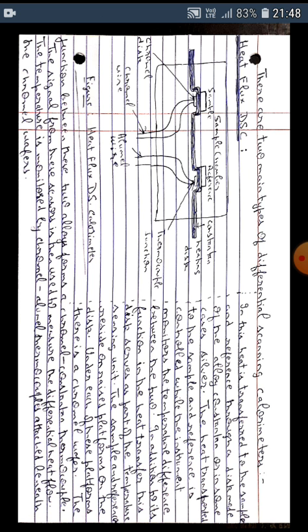In this instrument, heat is transferred to the sample and reference through a disc made of the alloy constantan, or in some cases silver. The heat transported to the sample and reference is controlled while the instrument monitors the temperature difference between the two. In addition to its function in the heat transfer, this disc serves as part of the temperature sensing unit. The sample and reference reside on raised platforms on the disc.